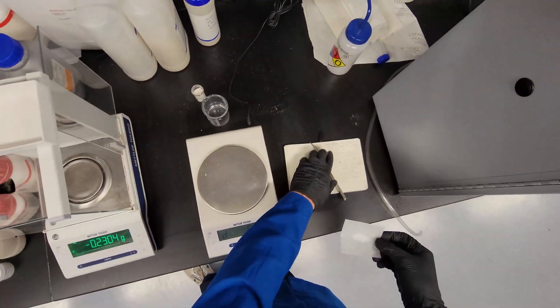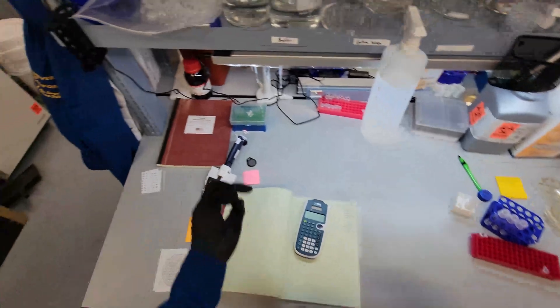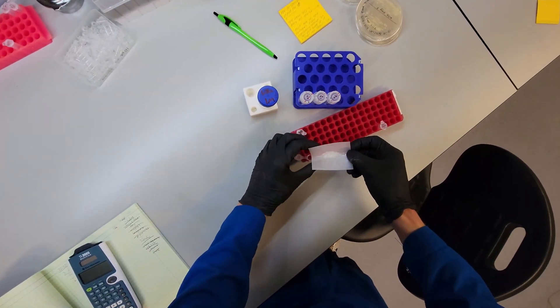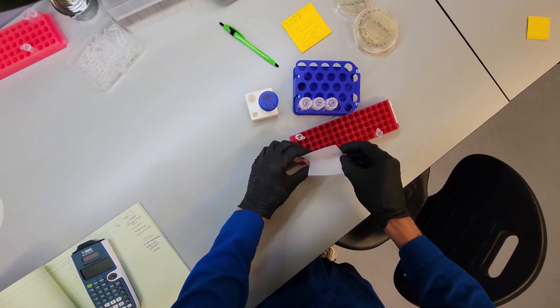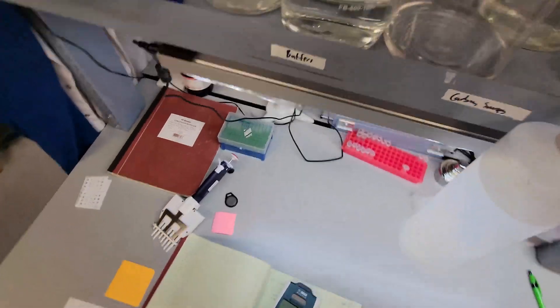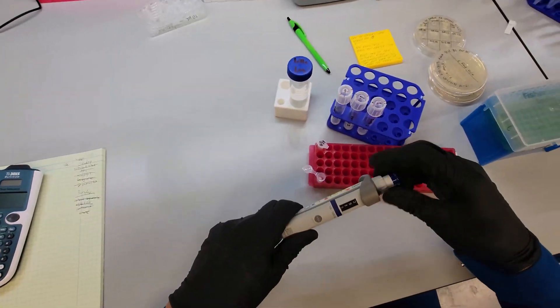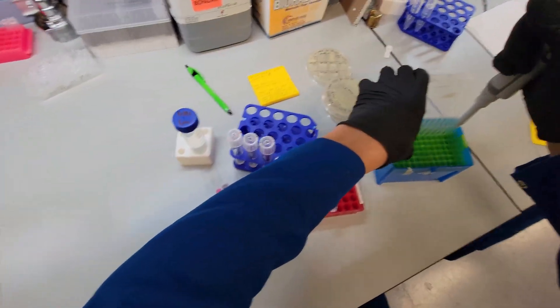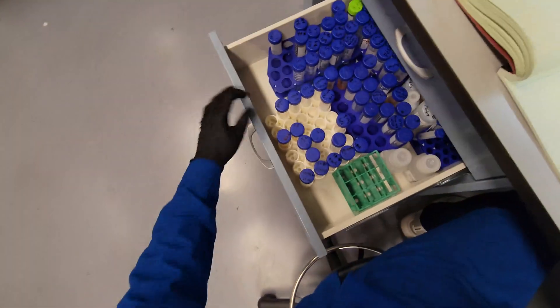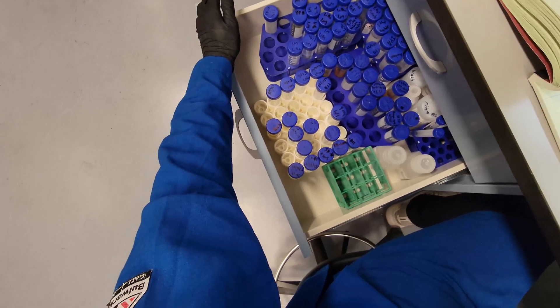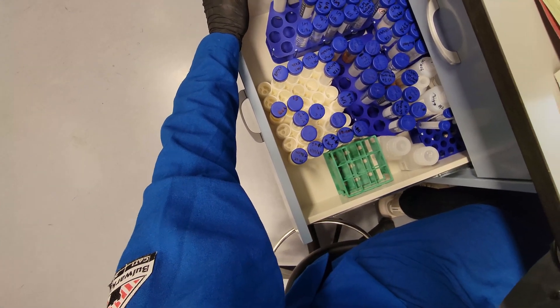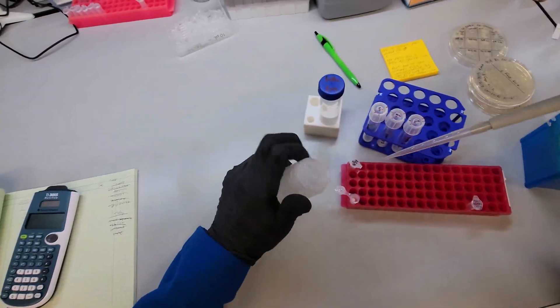We will try to dissolve it in a total volume of 857 microliters. This is a pretty highly concentrated amount of PEG. So it's kind of a pain to dissolve. So we might need to heat it up a little bit. I'll start with like 500 microliters and see how that goes. We'll just use sterile water. And all my sterile water is gone. So we'll use Millicue water.